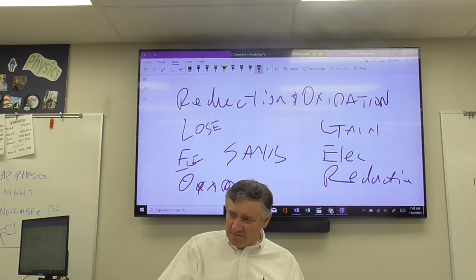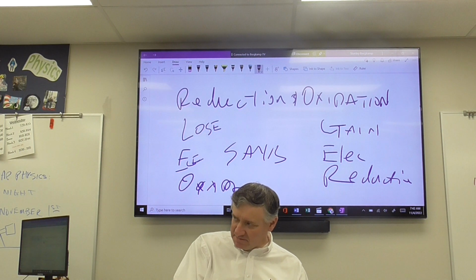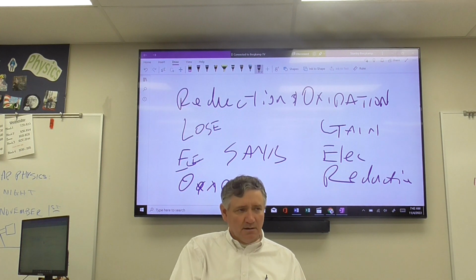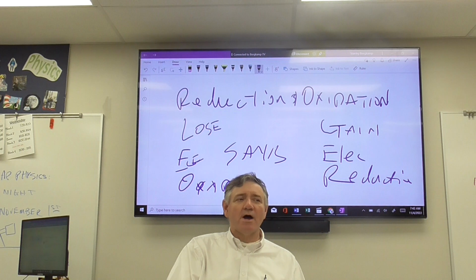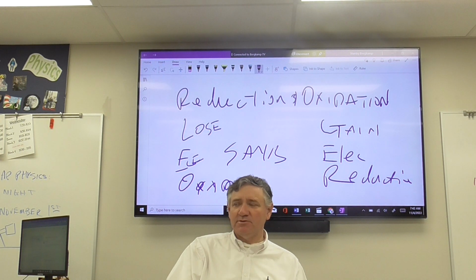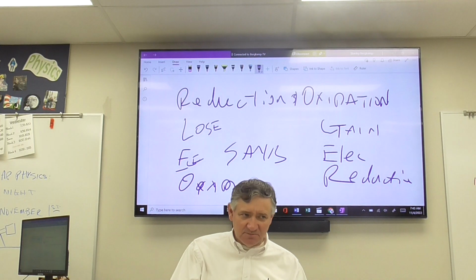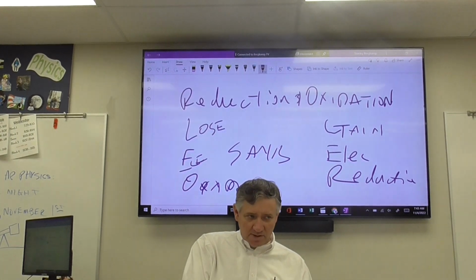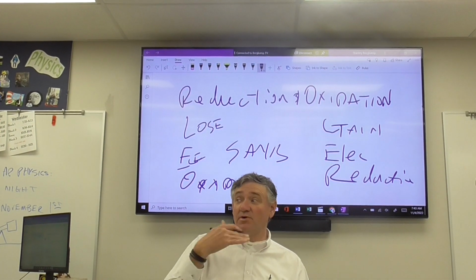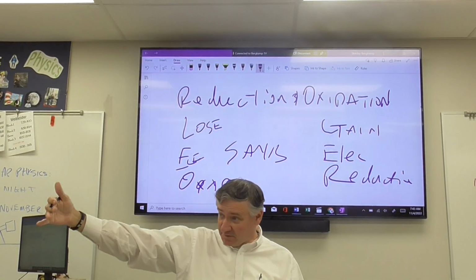Now, here's the other thing I'm going to emphasize. You are going to be dealing with some exceptionally caustic chemicals today: concentrated sulfuric acid, permanganate ions that will stain your clothes and get in your eyes. From the second you get in that lab and you start to get things around, you put on those safety glasses, okay? Without fail, I will have no tolerance whatsoever for not wearing safety glasses today, because there are so many things that can go wrong in terms of your eyes. And if you're wearing nice clothes and you're worried about getting something stained, there are those lab aprons there, you might even put those on.